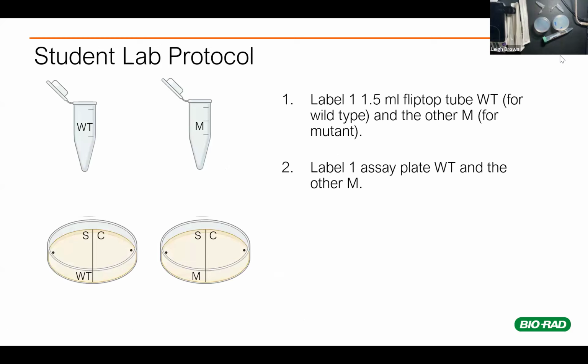So let's pull out your plates and some of the flip-top tubes and your Sharpie.